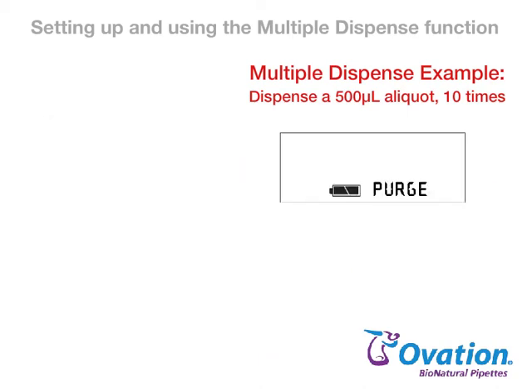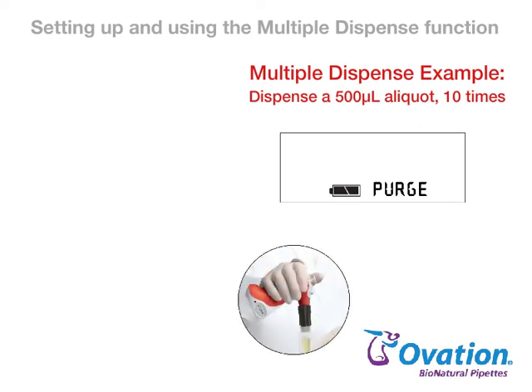After the final volume is dispensed, Purge appears on the display. Press and release the pipetting trigger to discard any remaining liquid in the tips. Purge can also be used at any time to end a liquid handling function by simply pressing the center button followed by the pipetting trigger.